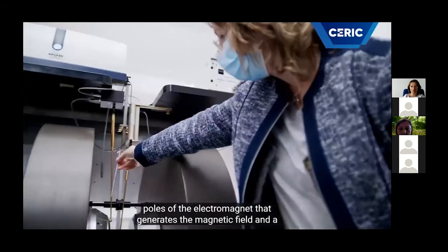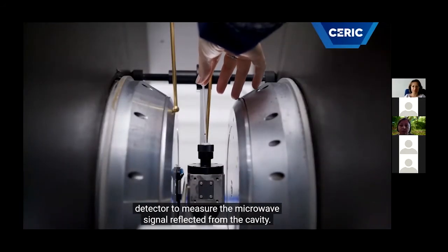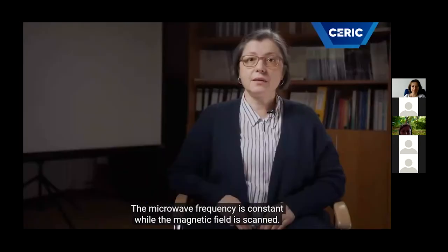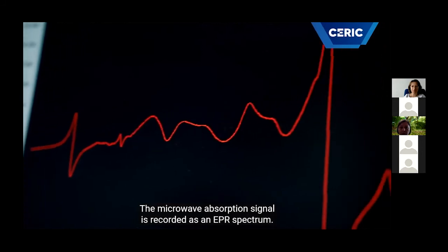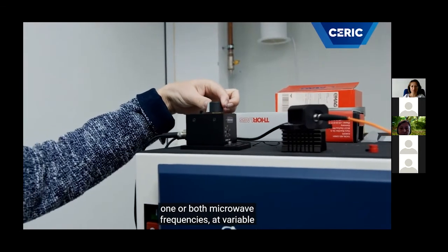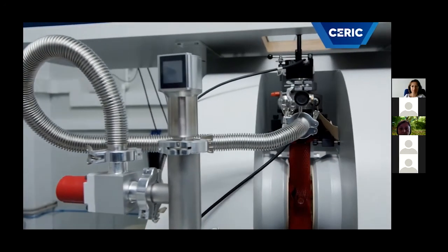inserted between the poles of the electromagnet that generates the magnetic field, and a detector to measure the microwave signal reflected from the cavity. The microwave frequency is constant while the magnetic field is scanned. The microwave absorption signal is recorded as an EPR spectrum. Depending on the samples and the information required, the experiments can be performed at one or both microwave frequencies at variable low temperature with in situ illumination.